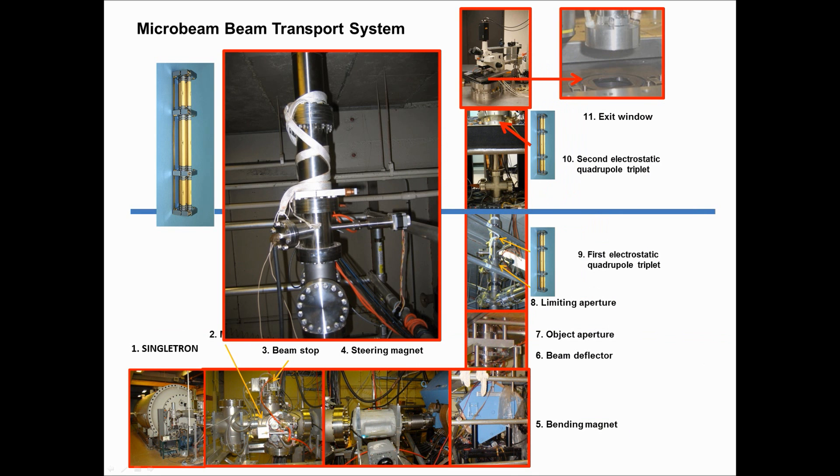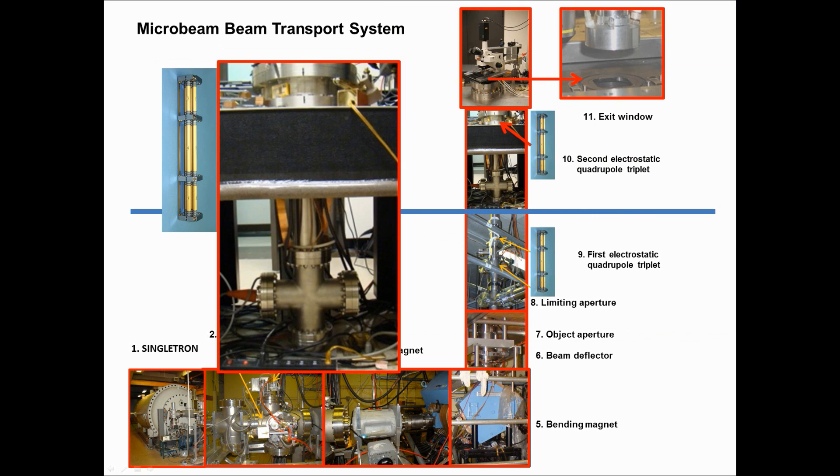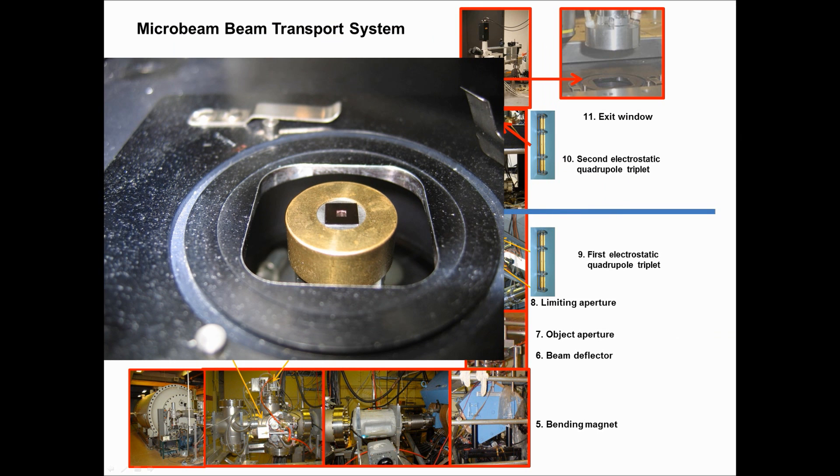From there we have the first electrostatic lens is located inside this beam pipe here. These pieces are motors which are used for aligning the system. The two lenses are inside a metal tube which I think you'll see a sample of it down there out on the bench. So our first procedure is to align the two lenses inside this tube. The two lenses are lined up with each other inside a tube which is then brought down inside the beam pipe. And these actuators move the bottom of the tube around. And what we have to have in line is the object aperture, the lenses, and the focal point. So these things are for doing the alignment of the lens tube with everything else.